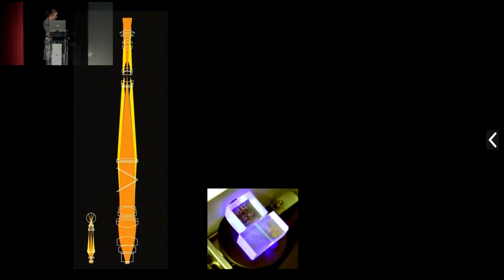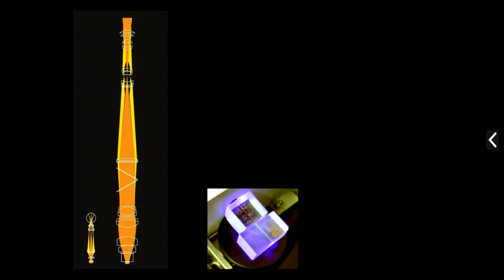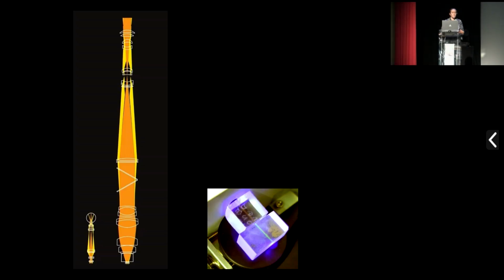This diagram on the left-hand side shows the light path of a normal light microscope, where the specimen sits here. You've got your objective lens, tube lens, eyepiece, and rather ineffective human eye as a detector. This is the Mesolens path shown next to it for scale. So it's roughly the same length and width as a human arm.